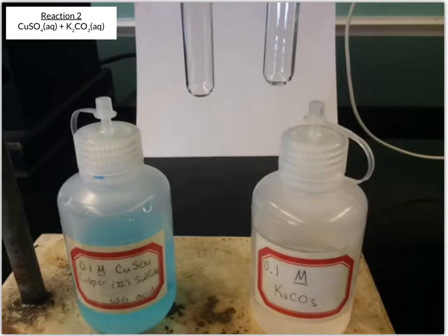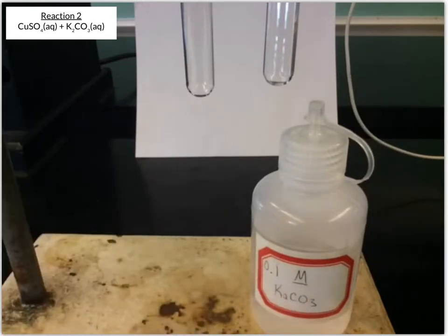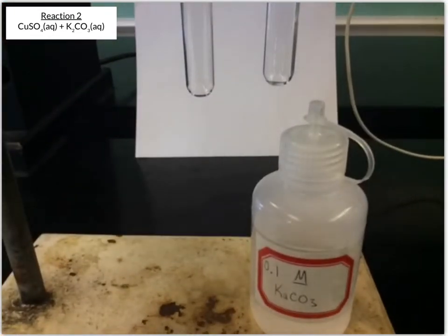For the second reaction, we're going to take copper 2 sulfate and combine it with potassium carbonate and see what happens. So first, I'll do about 1 milliliter of each of these solutions in the test tubes.